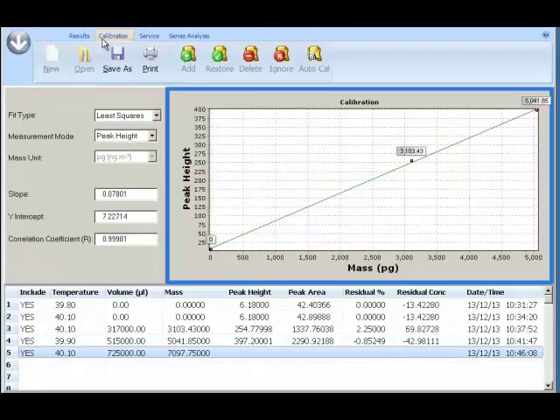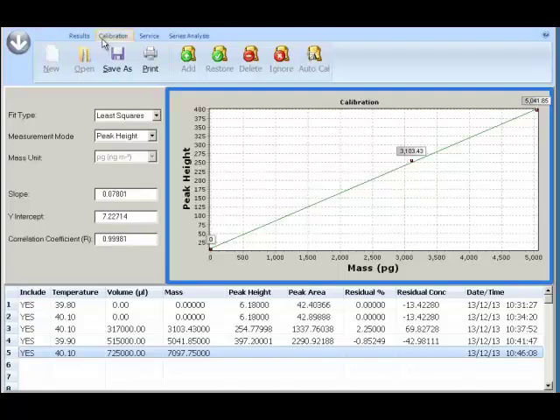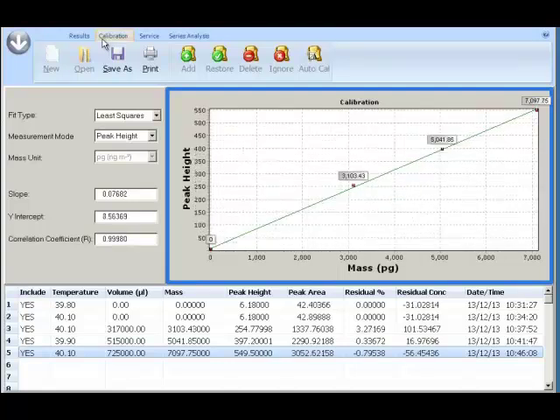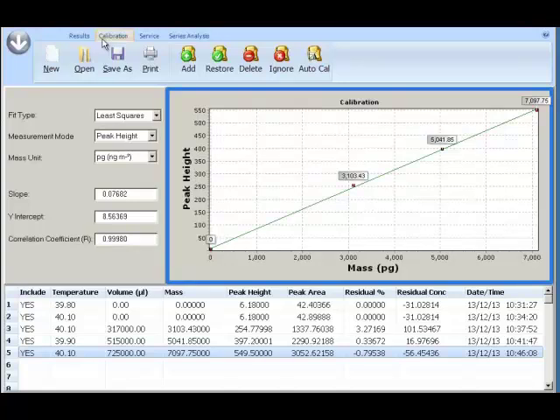When calibration is finished, the calibration will be displayed in the calibration tab. You can see here that the calibration we obtained is quite good and it's got correlation coefficient of 3,9 and 8.